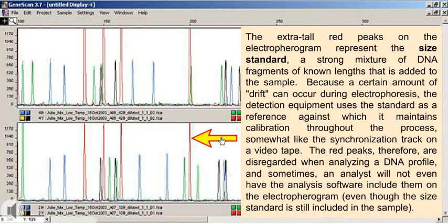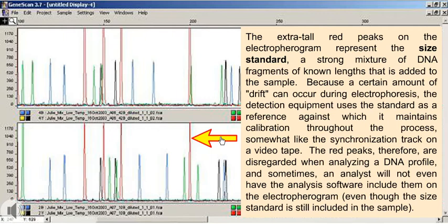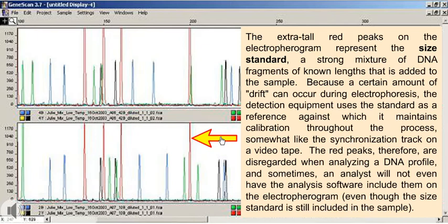The extra tall red peaks on the electropherogram represent the size standard, a strong mixture of DNA fragments of known lengths that is added to the sample. Because a certain amount of drift can occur during electrophoresis, the detection equipment uses the standard as a reference against which it maintains calibration throughout the process, somewhat like the synchronization track on a videotape. The red peaks are disregarded when analyzing a DNA profile, and sometimes an analyst will not even have the analysis software include them on the electropherogram, even though the size standard is still included in the sample.